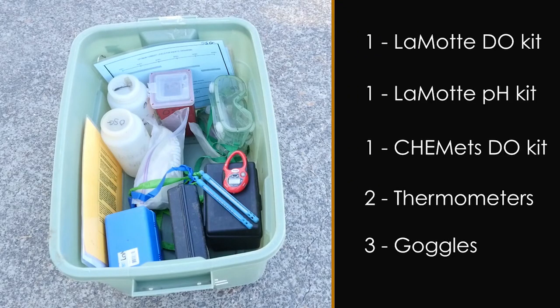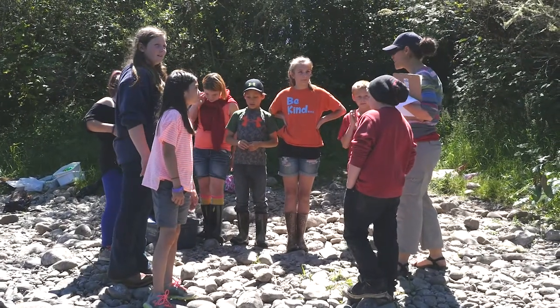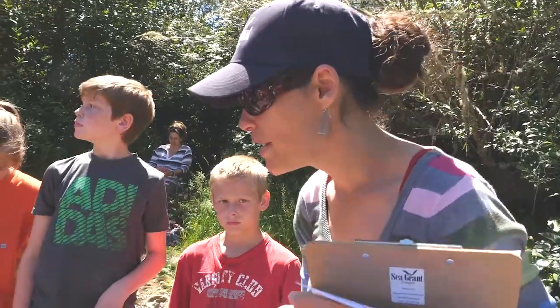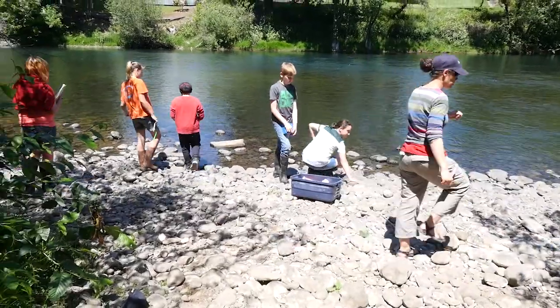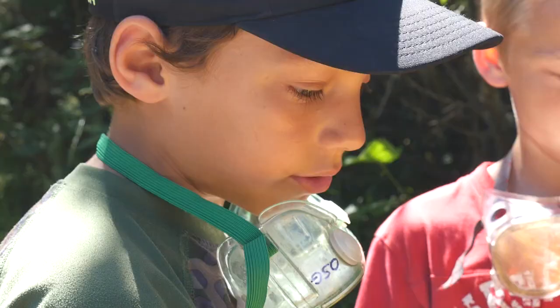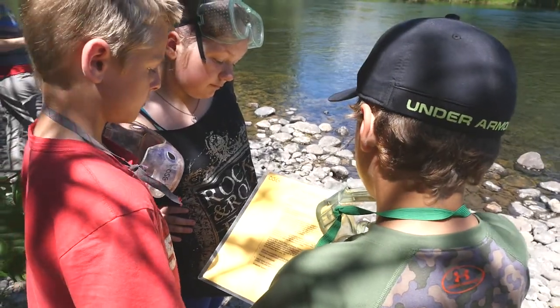Each LaMotte Field Kit includes the following contents. Before distributing the water quality tests, discuss each test with the students and review the safety guidelines. Have the students break into groups and conduct the various tests. Each test contains a direction sheet, and students should read the directions out loud before they start their test.